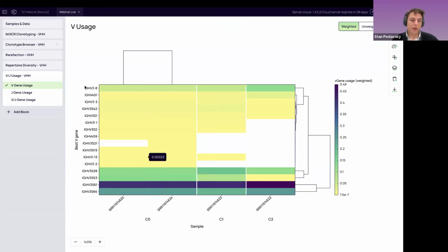It's alpaca, a real immunized animal, and we always will have a distribution like this for non-synthetic, non-artificial libraries. So basically, what this picture tells us is that the selection process is not largely biased to one specific gene.